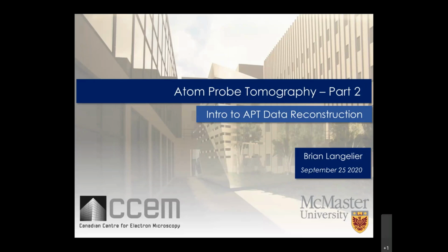Yeah, good morning, everyone. As Sam mentioned, this is the second part of the plan for the Atom Probe talks. Originally I had planned on doing both Atom Probe data reconstruction and analysis in this webinar. In practice, I found that just covering the reconstruction was maybe enough for one webinar, so possibly going over analysis of Atom Probe data at a future date.